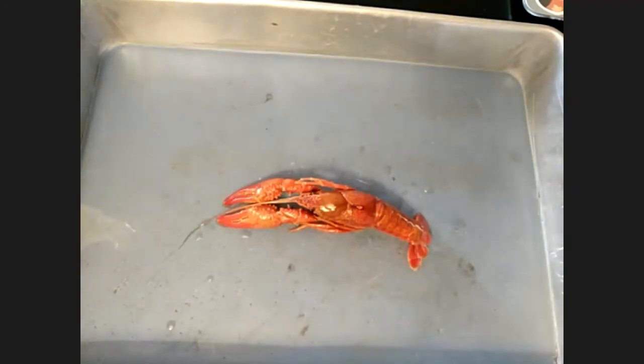And because they have an open circulatory system, that means that they don't have blood vessels. So in order for us to see where the blood is going to be, they inject all of their organisms with this pink rubber stuff. So if you see this hot pink thing inside of the crawfish, that would be where the blood would be if this organism was alive.